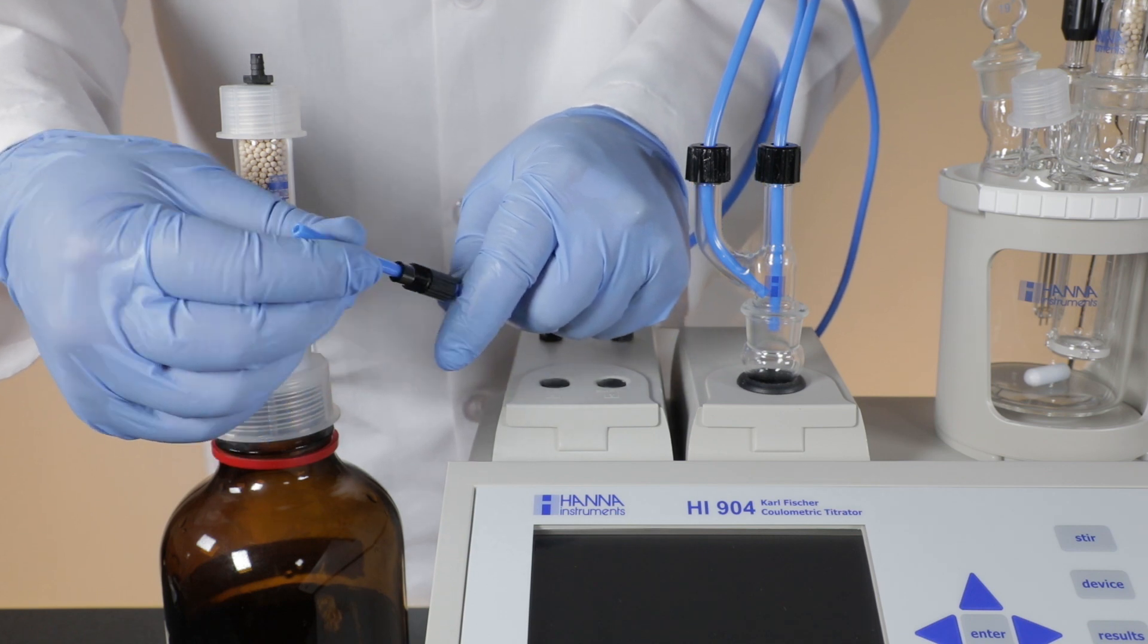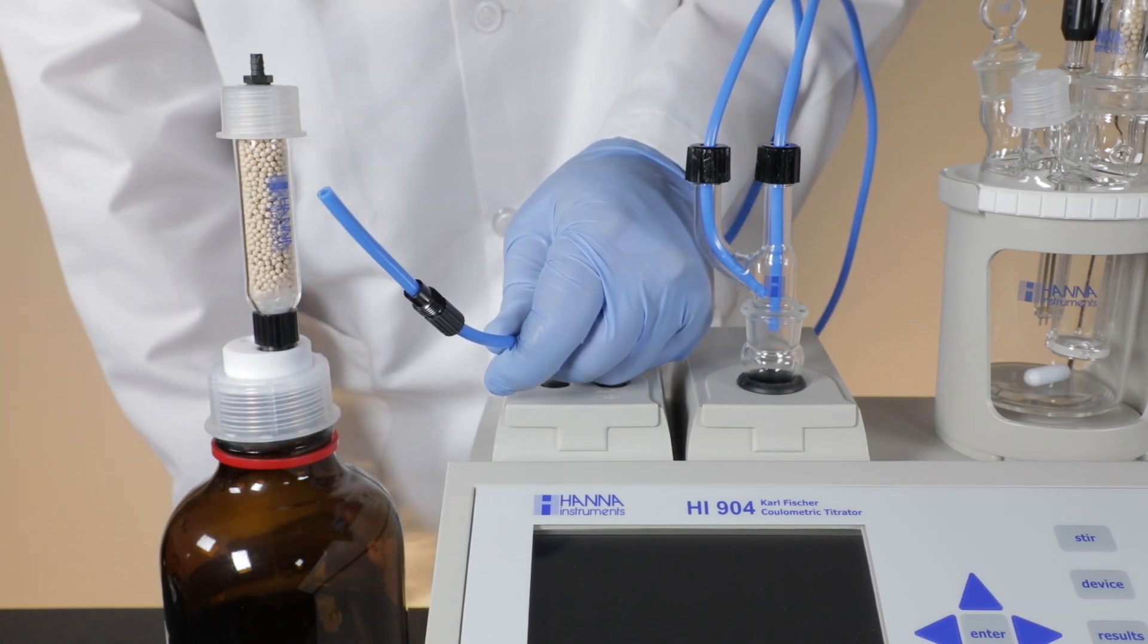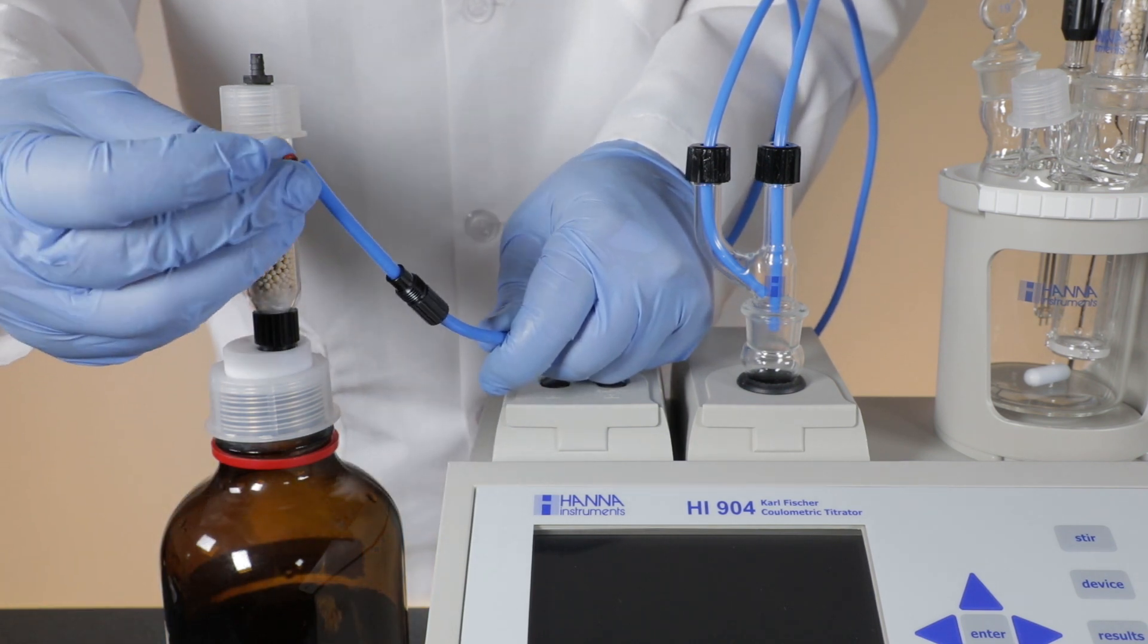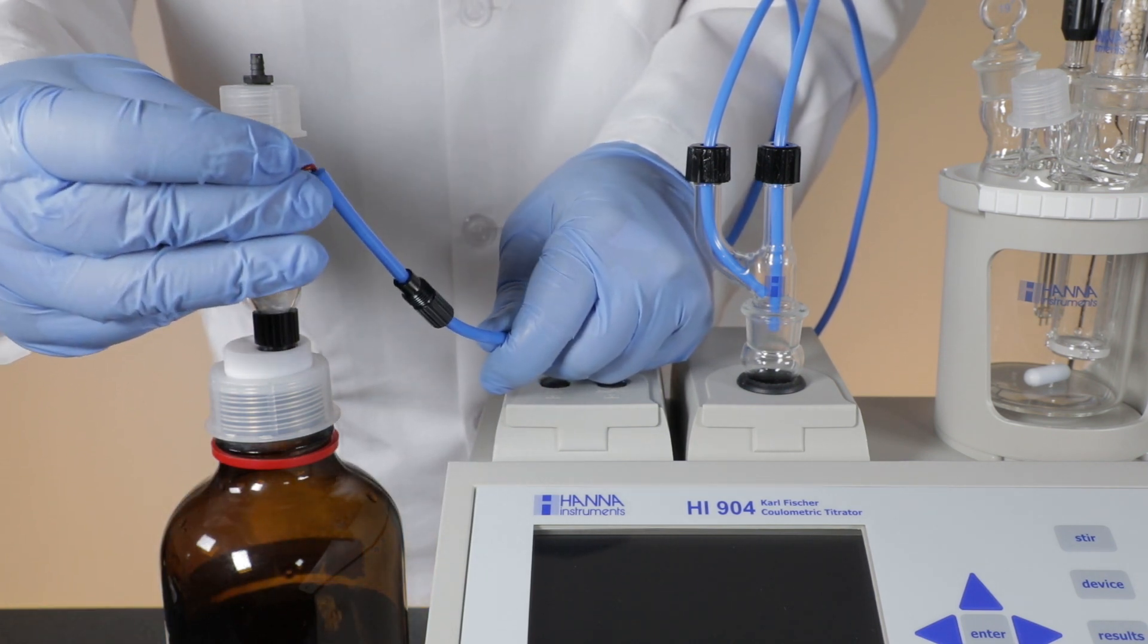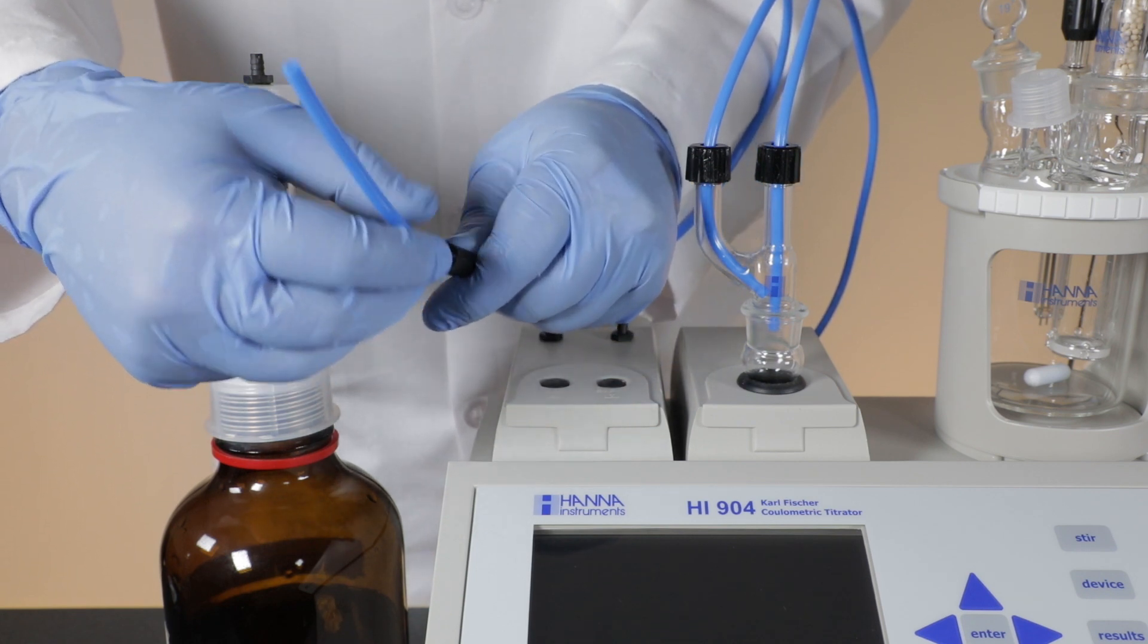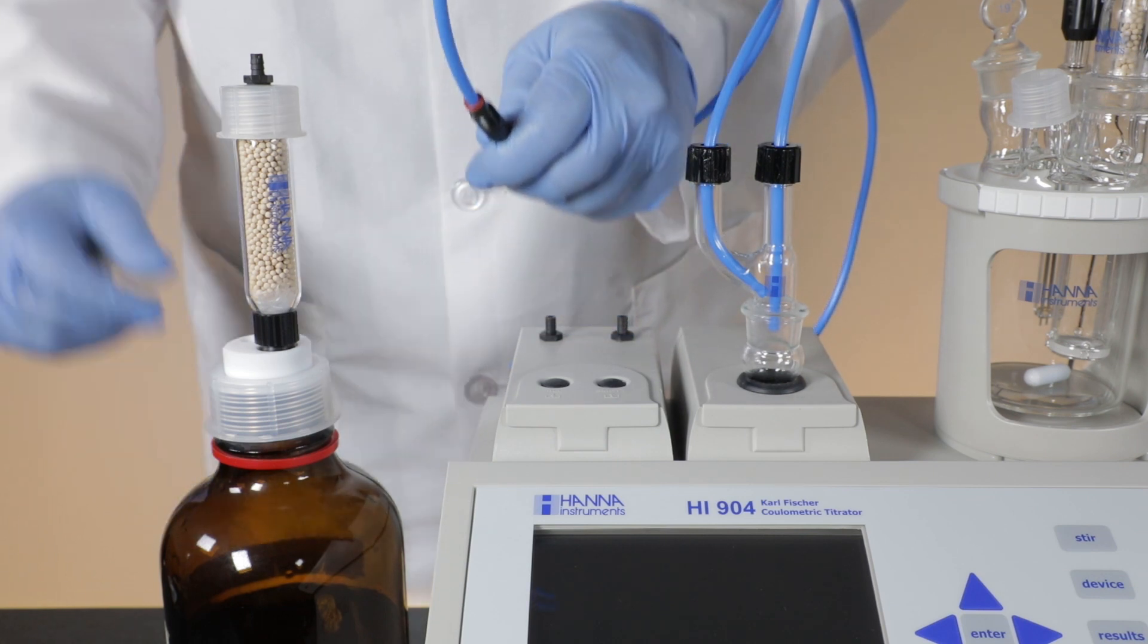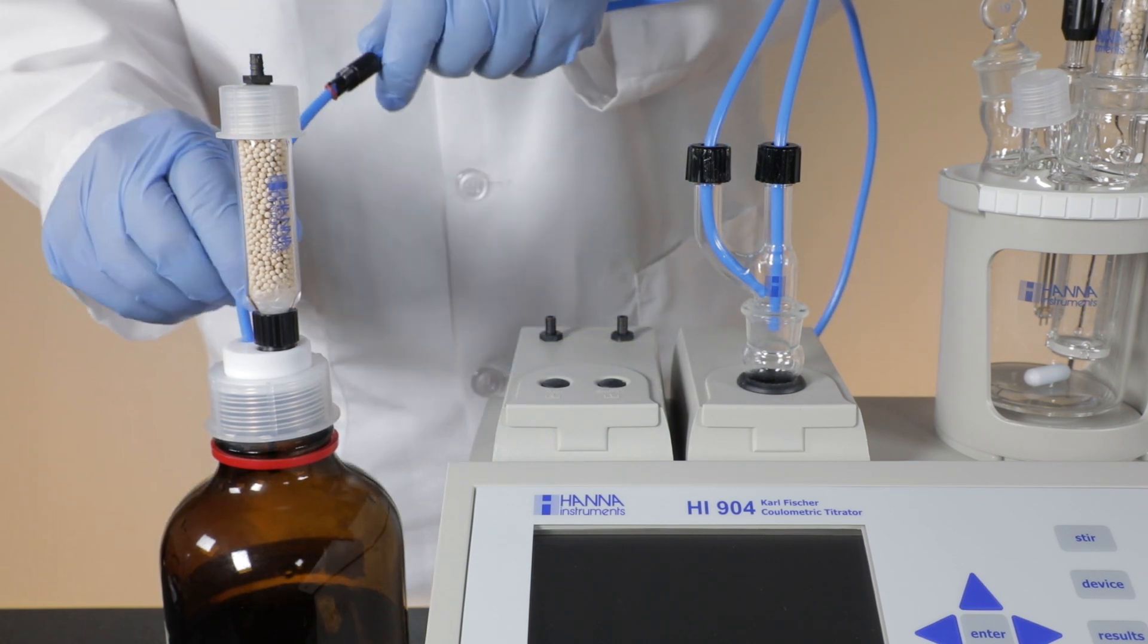Now, insert the tubing from the analyte port on the reagent exchange adapter into the 5mm fitting and red O-ring. Push the tubing down into the bottle and screw the fitting onto the bottle top.